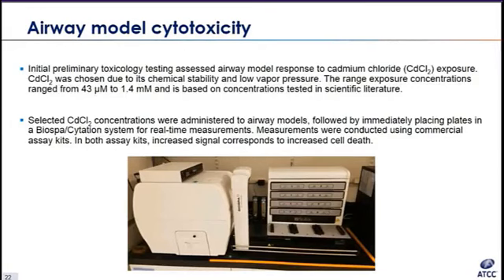For these initial preliminary toxicology tests, we assessed the response of early airway models to cadmium chloride exposure. Cadmium chloride was chosen due to its chemical stability and low vapor pressure. Here, we exposed cells to cadmium chloride concentrations ranging from 43 micromolar to 1.4 millimolar. These concentrations were based on previous scientific literature.